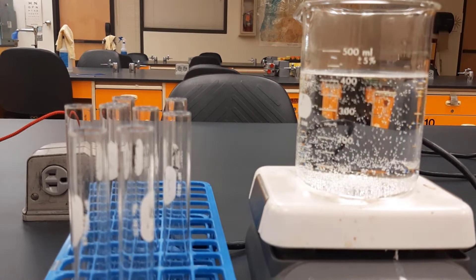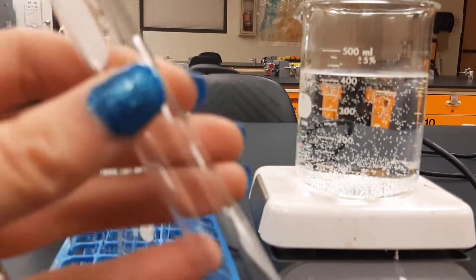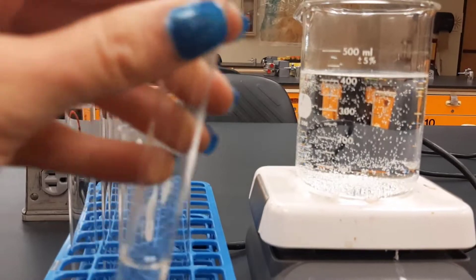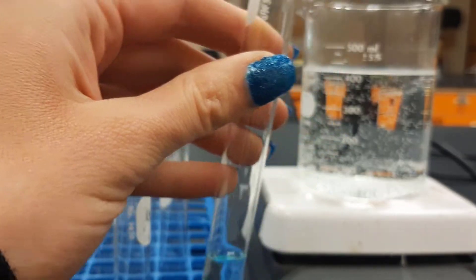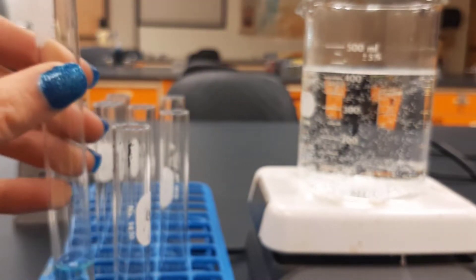First we have to set up our positive and negative control, just like we did last time. Our negative control is just going to be water. I'm going to put some DI water in here and a few drops of Benedict's. It's a nice light blue color — that's our negative control.